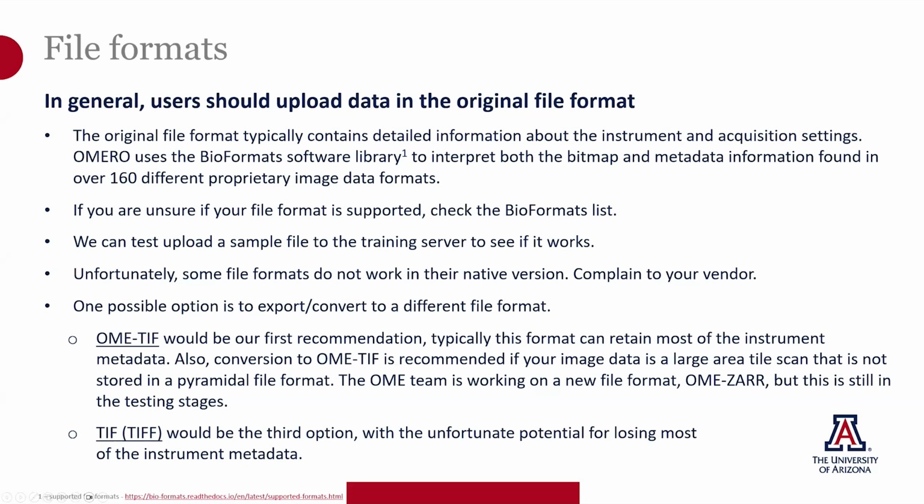So what do you need from data to be able to reproduce it later on? In general, you want to plan to upload your data in the original file format. That's because OMERO uses the Bioformats software library, which allows it to interpret both the bitmapped image data as well as the associated metadata found in over 160 different proprietary image file formats. If you're not sure if your file format is supported, check the Bioformats list of supported formats. There'll be a link to the list found in the notes below this video.